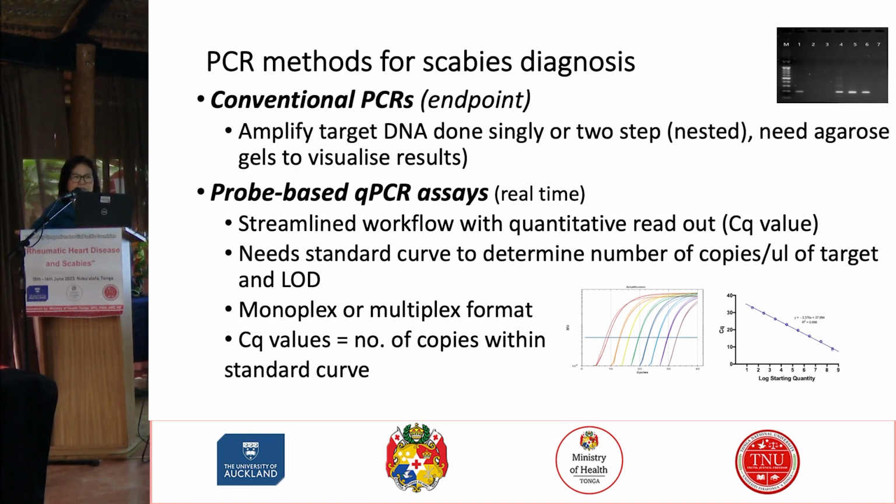PCR is, remember when we had COVID, we got all the swabs and they put them on a PCR instrument.